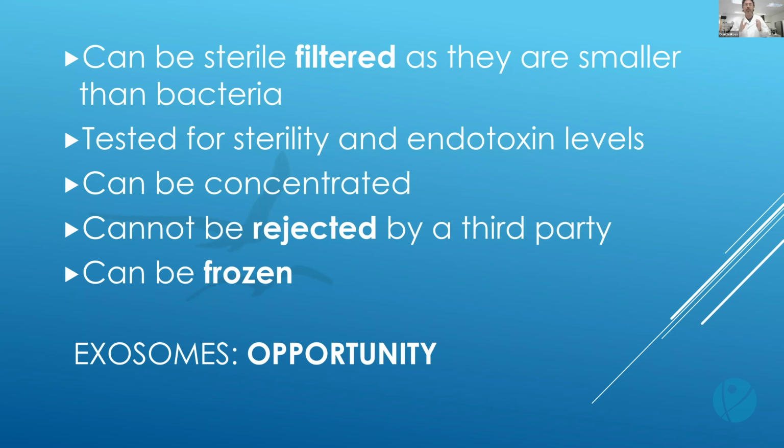And in fact, I might want to make an inflammatory exosome in the future for use in tumor therapy. However, what we're using right now has very little, if any, HLA on the surface. Now, the benefit of this microscope I just got is I can stain for that HLA and see it on the surface of that exosome, which was previously impossible.